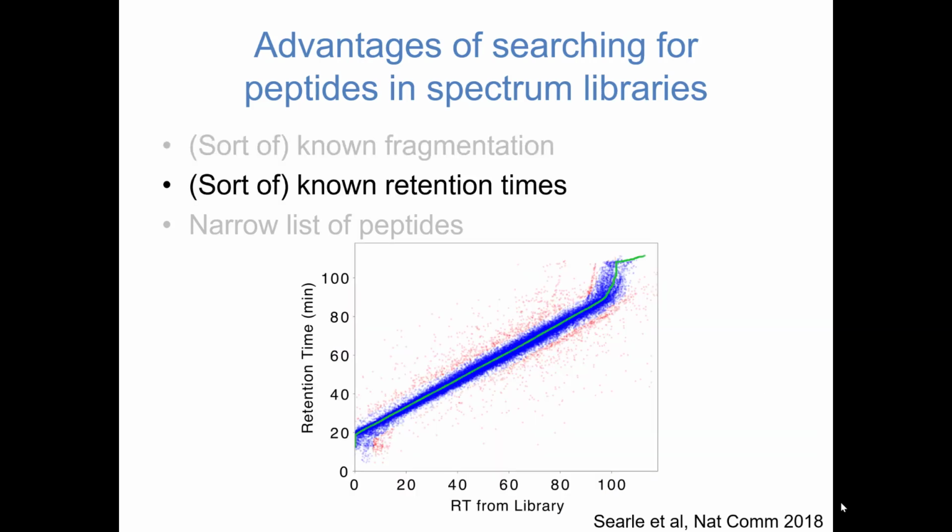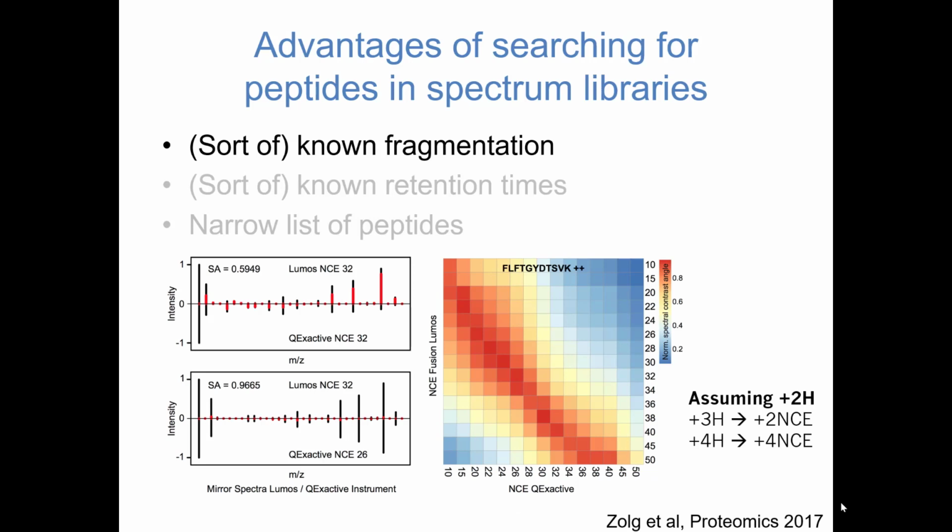Could you mention again what's mapped in red on those butterfly plots? Yeah. So this is sort of the mass or the intensity error, right? So this black and this black are the same. The red is the deviation between them. But the tendency relative to each other seems actually preserved with these three peaks. Like, this is the highest, and this is the highest here, right?